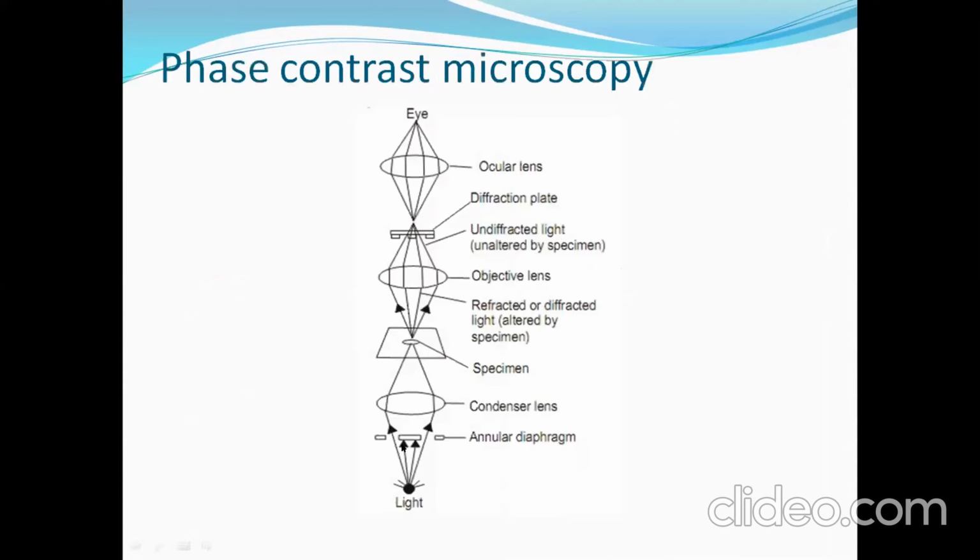So we can use the microscope for identification of different types of microorganisms. Not only that, it can bind specifically with different parts of the cell, either with the DNA or with other parts like that.